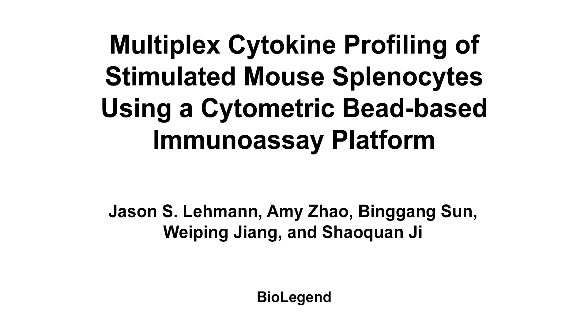The overall goal of this protocol is to quantify multiple cytokine targets simultaneously in tissue culture supernatants collected from stimulated mouse splenocytes using a multiplex bead-based immunoassay and a flow cytometer.